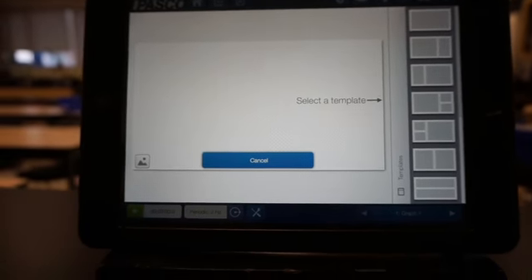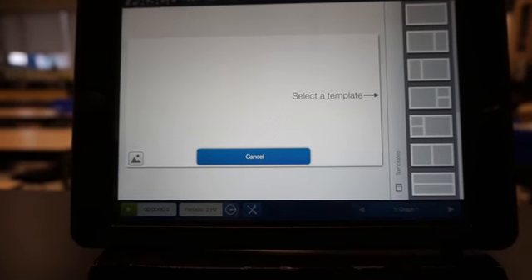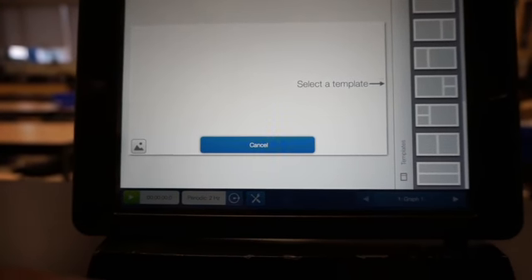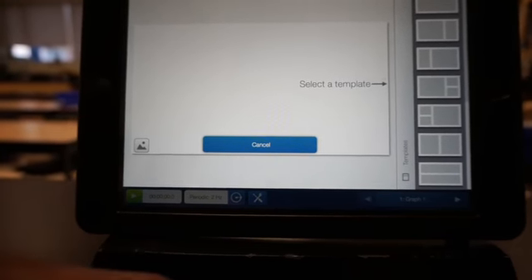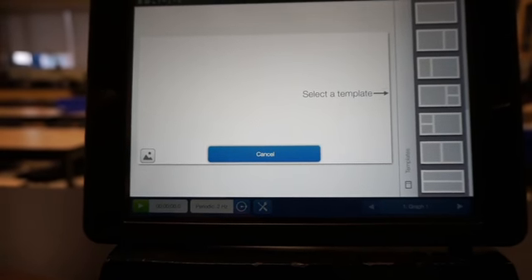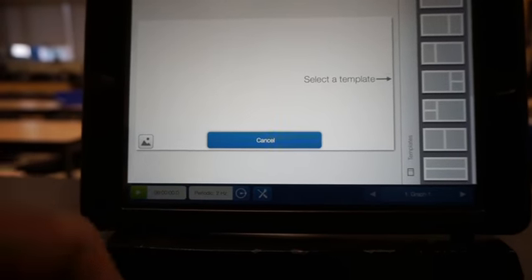Now, depending on what kind of experiment you're running, if you want to run a graph to see what the change is over a period of time, then you're going to use the graph option. If you just want to get a direct measurement, you might use a measurement meter button. So I want both in the greenhouse gas lab. I want to see what the change is over a period of time, and I want to see what the temperature is at a specific instant.